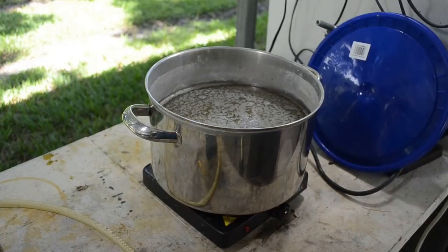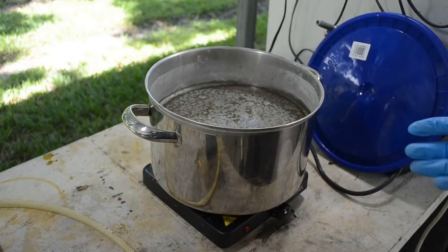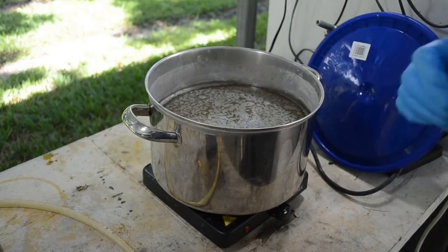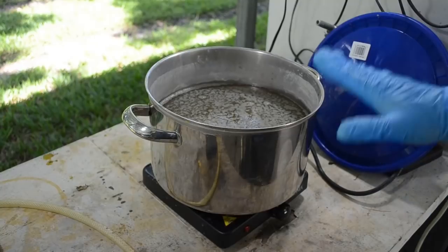Okay, so now, if you've been using zinc strips instead of zinc powder like I used, you shouldn't have to filter this. You can just pull the strips out and go to the next step. But the instructions do say if you've been using zinc powder, you need to filter this.